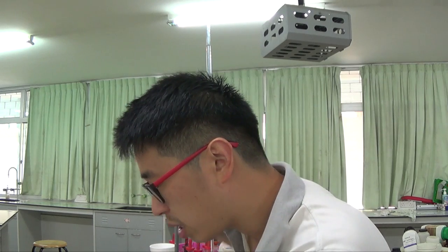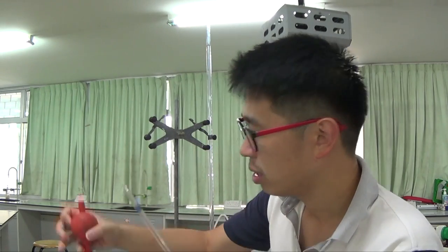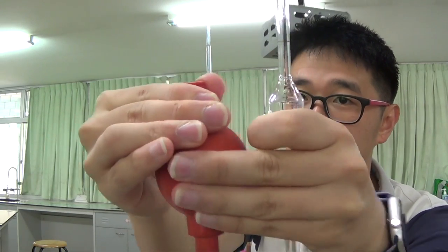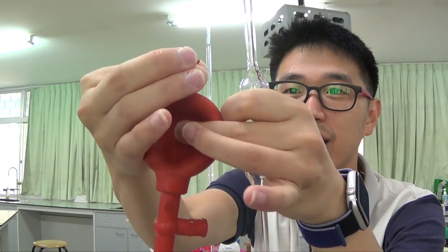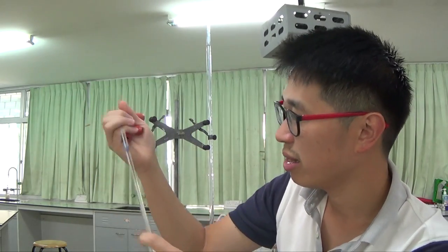Okay, so that was Q, dilute sulfuric acid in the burette. Now I have to take 25.0 cm³. This is a pipette filler. It's got an air bulb there to suck in the air, which I'm going to do first. I'm just going to push it in and suck in the air. S stands for suck, E stands for eject. So I want to suck in a little bit.